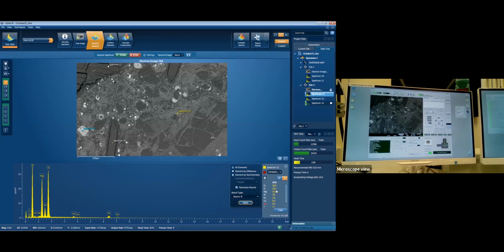So two minerals can be olivine and pyroxene. They're both magnesium, iron, silica, and oxygen. But the difference is that olivine has 4 atoms of oxygen to 1 silica atom, whereas pyroxene has 3 atoms of oxygen to 1 silica. So whilst they look the same in person, and they look basically the same in composition, by using this atomic percent, we can work out the difference.